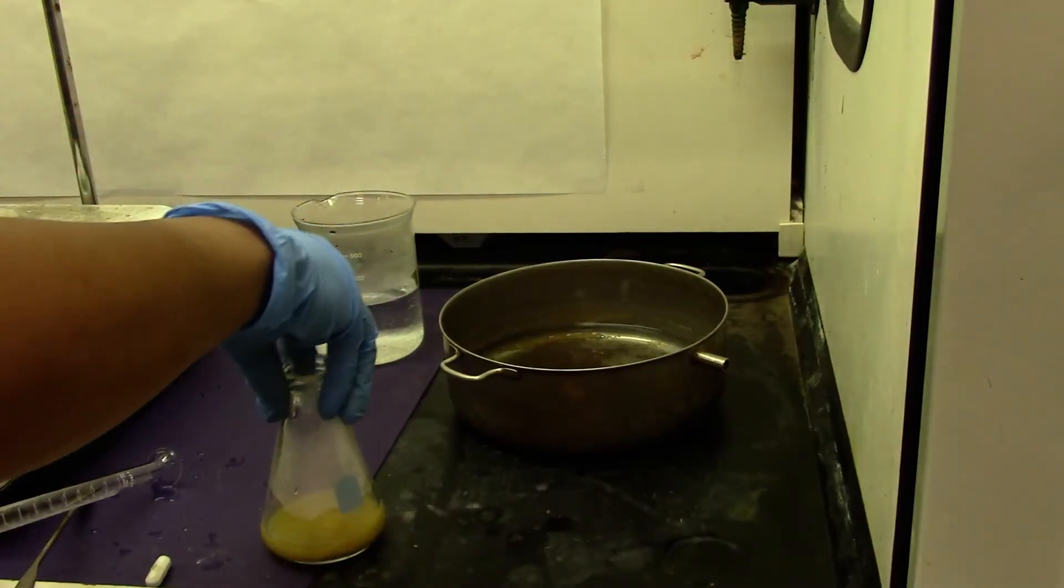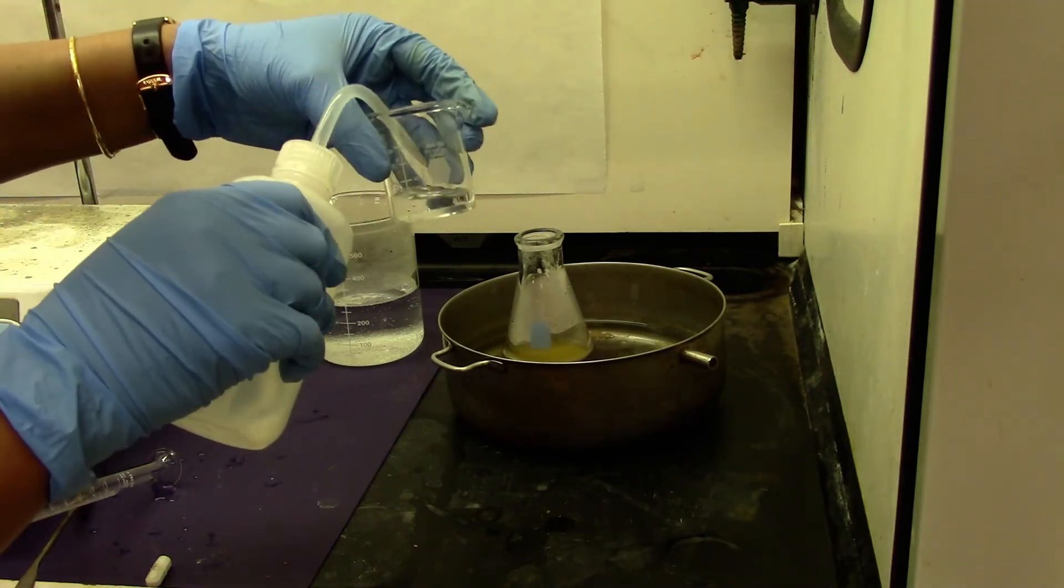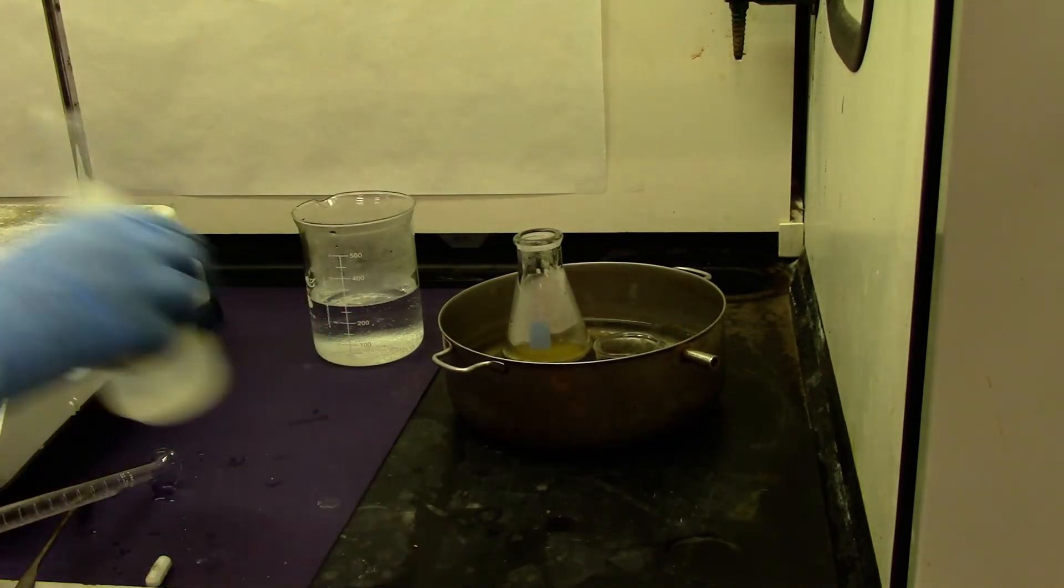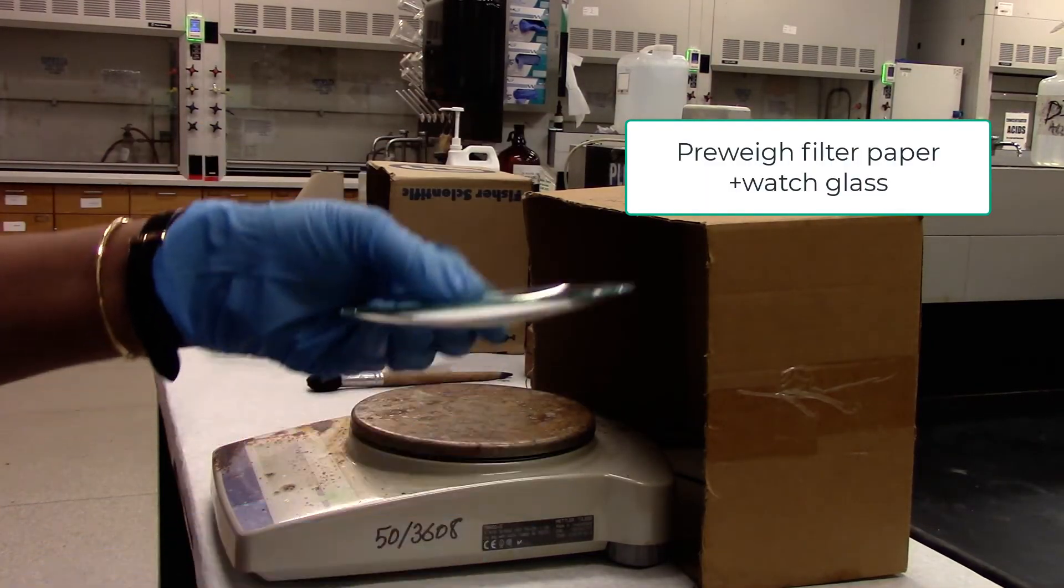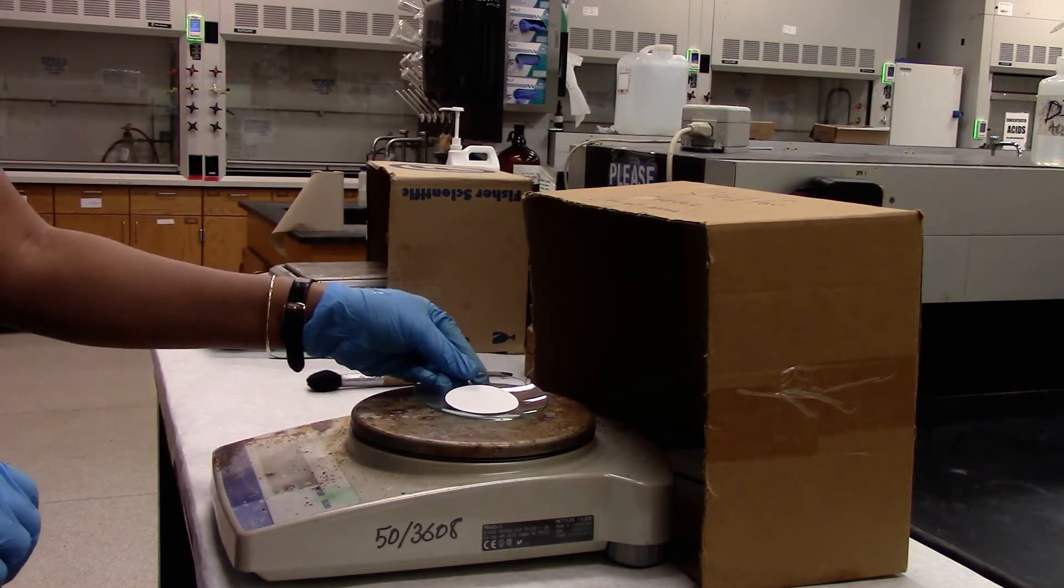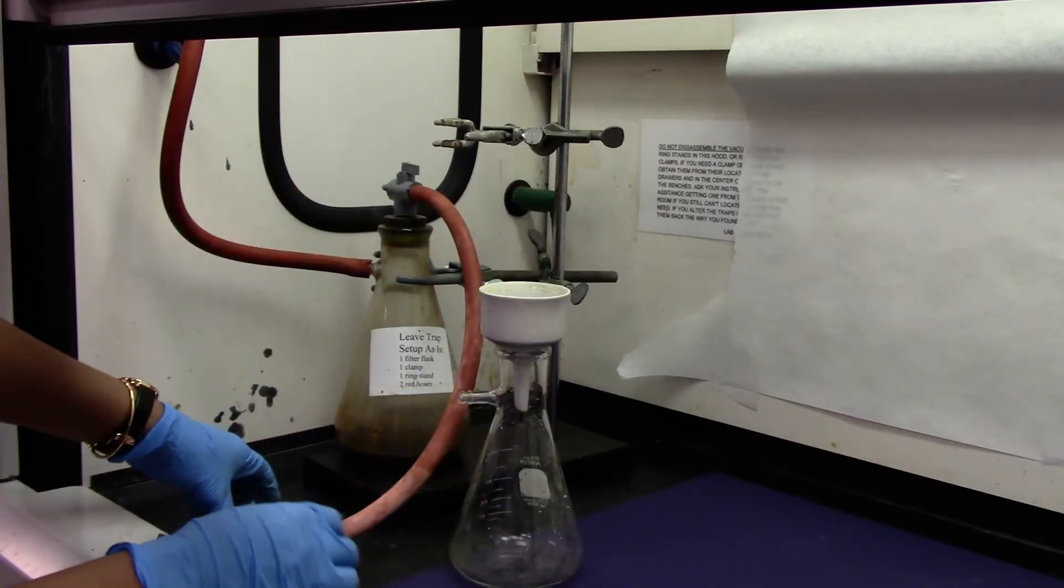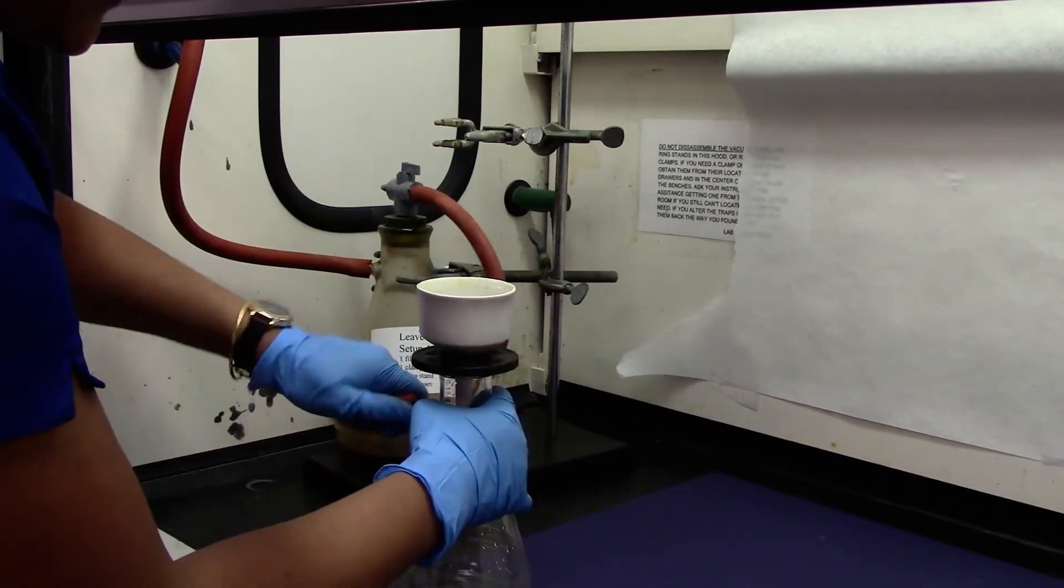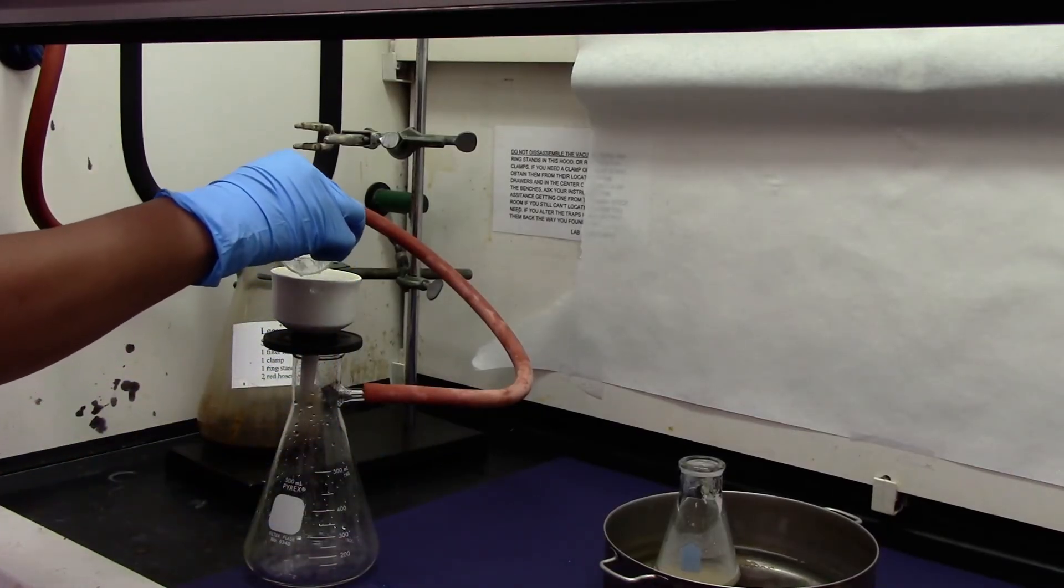I placed this flask with the crystals forming in the ice water. And I am also placing some DI water to cool down for the final filtration. Before the final filtration make sure you weigh the filter paper with the watch glass. Tare the balance and record the mass. Place the filter paper and connect it to the vacuum. Wet the filter paper with some cold DI water.